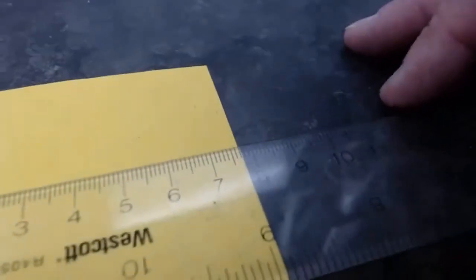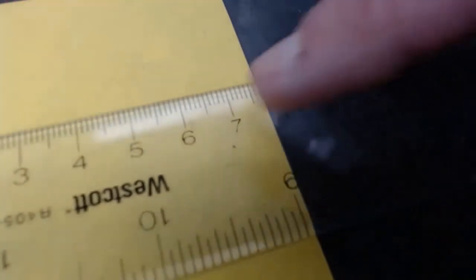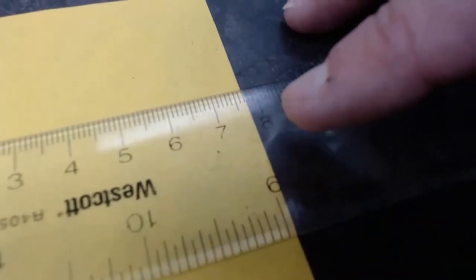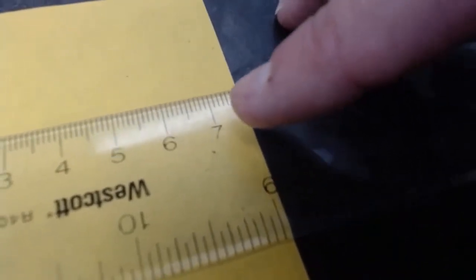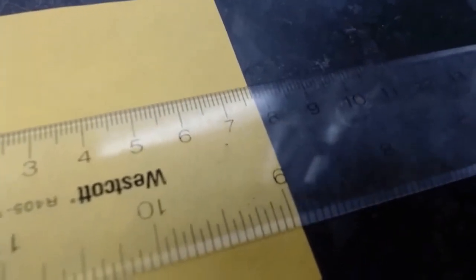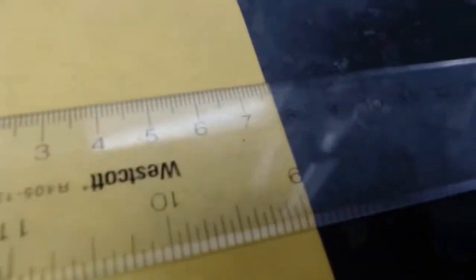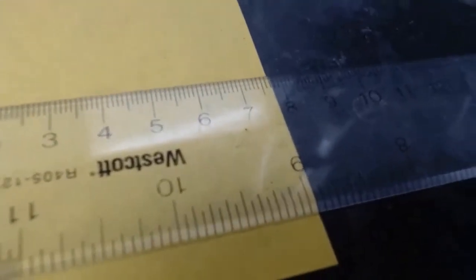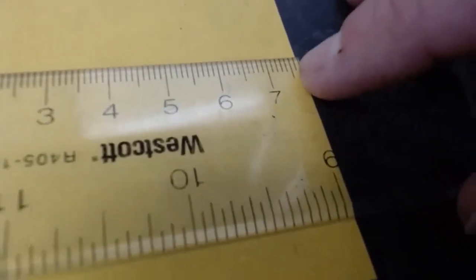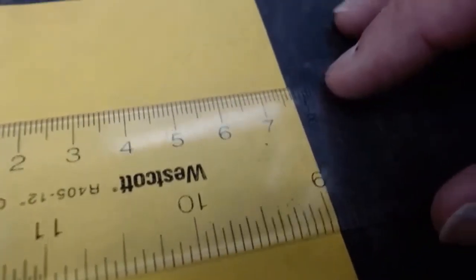Then you come over to the other end. And if you look, you'll see there's 6, 7, 8. And then in between the 7 and the 8, there are lines. Every line is a 10th. So since the lines mean a 10th, I know the 7 and I'll know how many tenths there are. So it looks to me like it is between, there's the 0.5, 0.6. It looks like it's between the 0.7 and the 0.8.